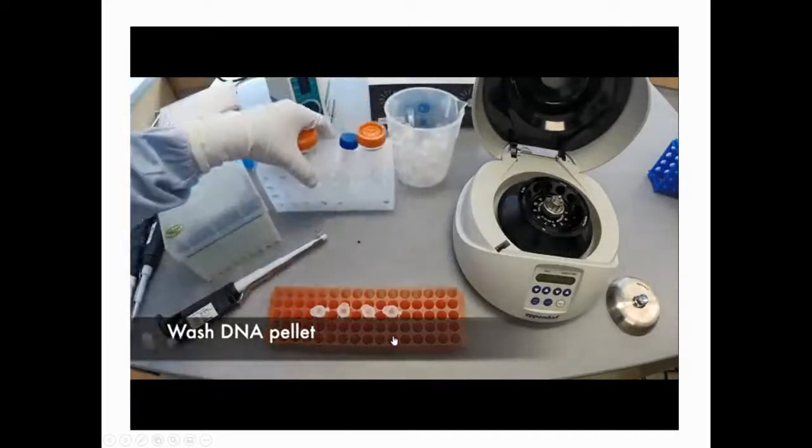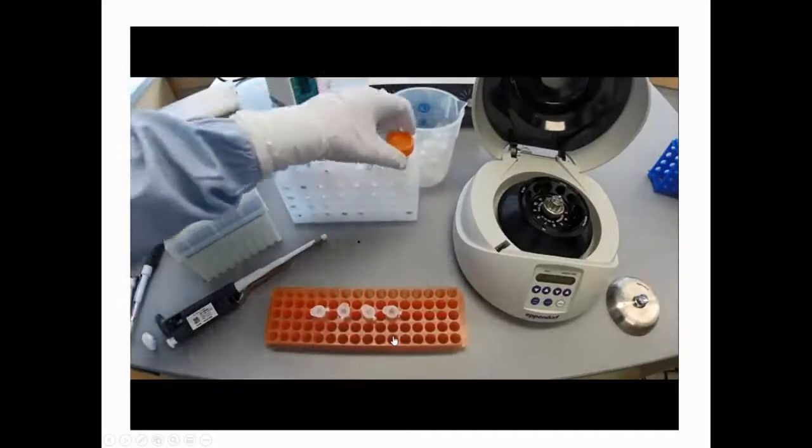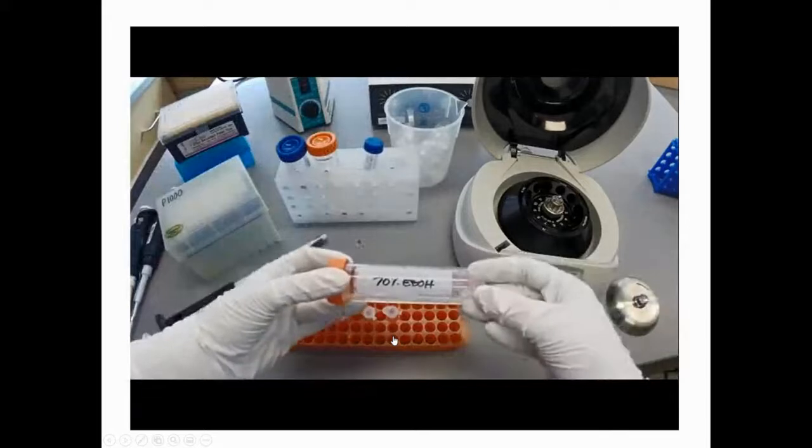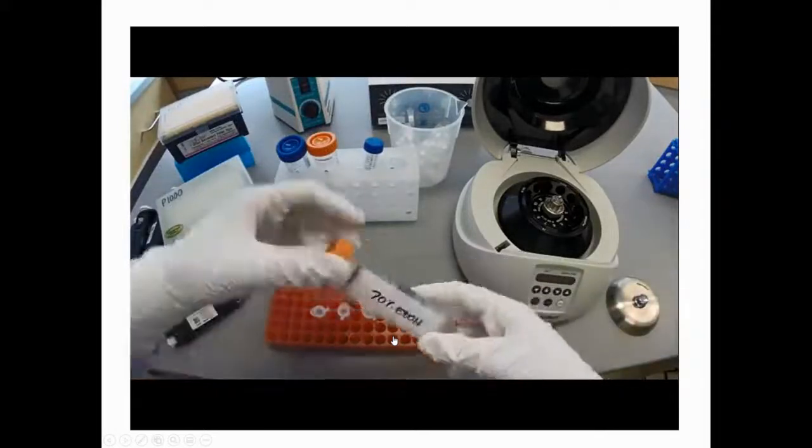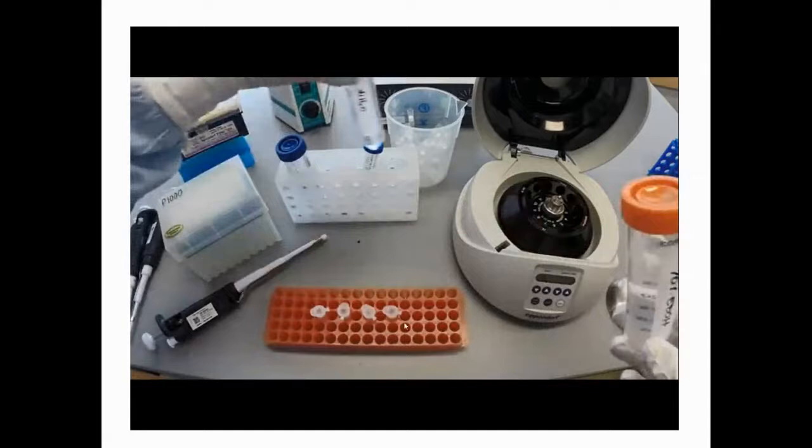Clean the DNA pellet by adding 250 microliters of 70% ethanol to each sample. So this is to wash the DNA pellet. All right. Remember, to precipitate the DNA, you use the 100% ethanol, and then to wash the DNA pellet, you use the 70% ethanol.